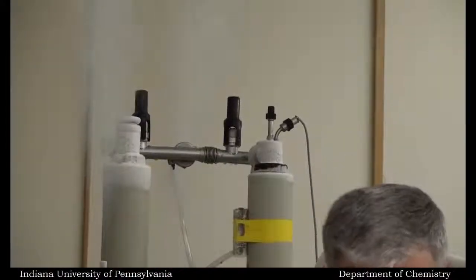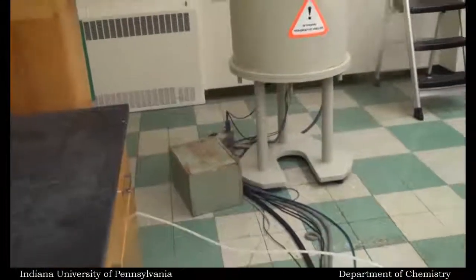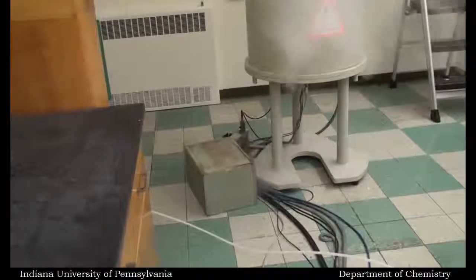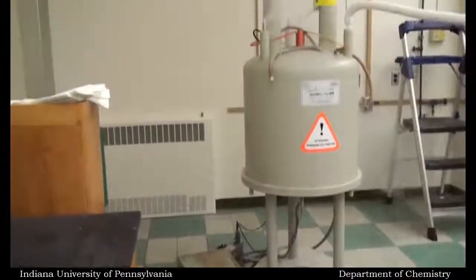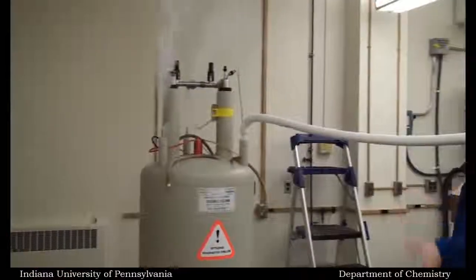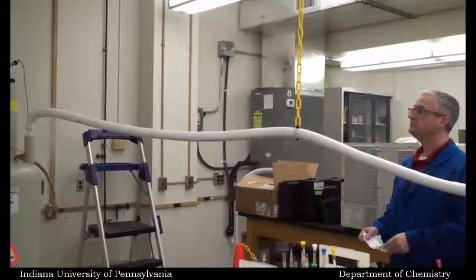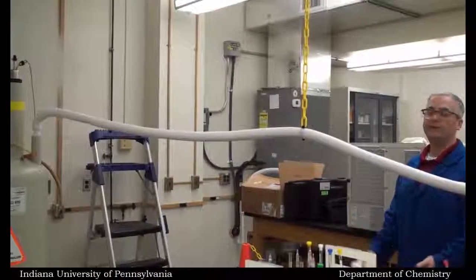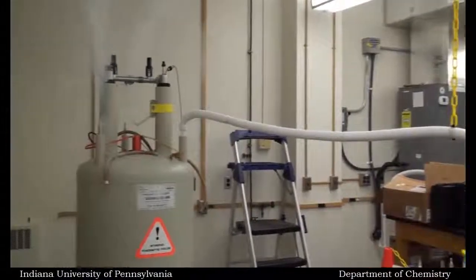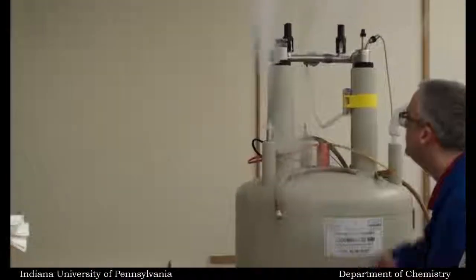So what we should probably do is just keep on turning it down. And our goal here is just to top her off. Again, the pulse now is just so nice and slow. And if you slow it down too much, not to worry, you can always increase it again until it starts spitting again. But you want to keep a nice slow pace.